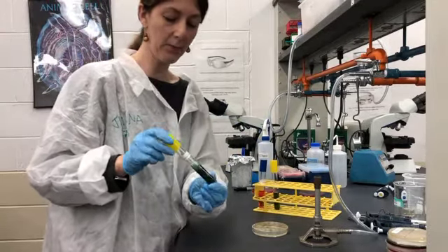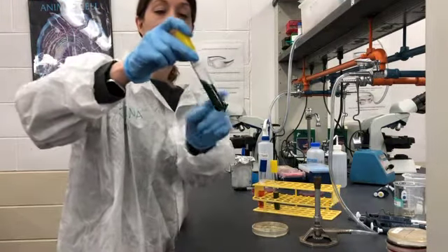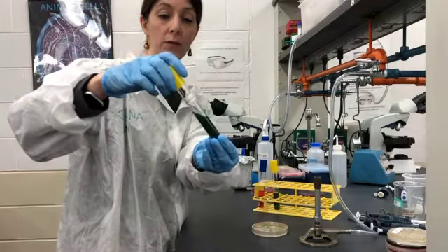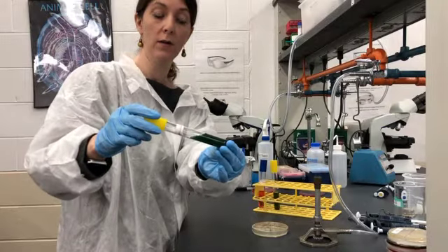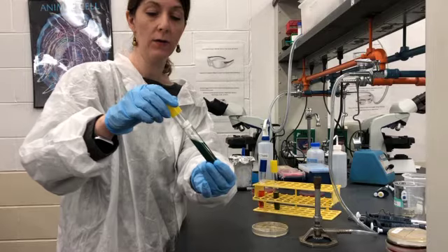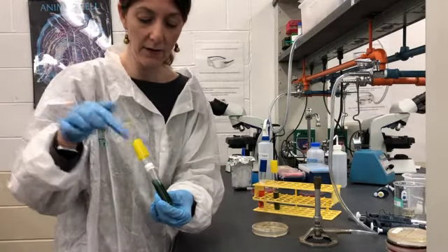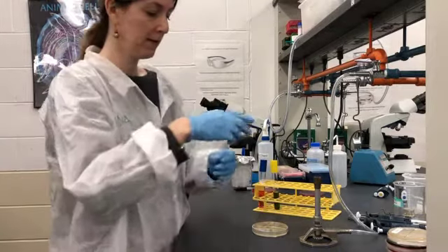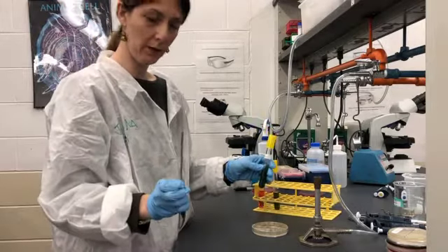Okay, next up we have our slant. Now I have to say this slant is very shallow. Sometimes you'll see the slant will take up maybe 40% of the tube. So they can look a little differently depending on the angle at which you are cooling your media. And so for this, we're going to want to make a zigzag pattern starting from the bottom and moving your way up. So after I label this, I am going to use the loop for this.